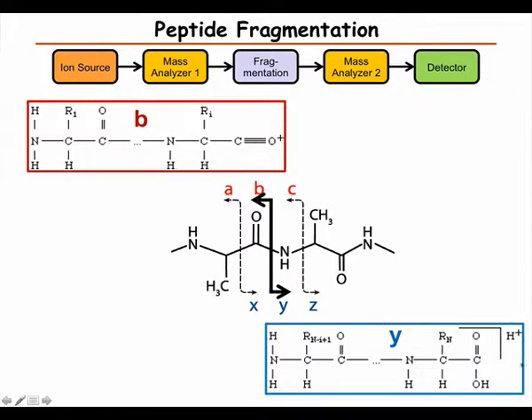And then it has a hydrogen, one proton that's attached to it. That's not always defined exactly where it is; it depends on where there are basic residues.